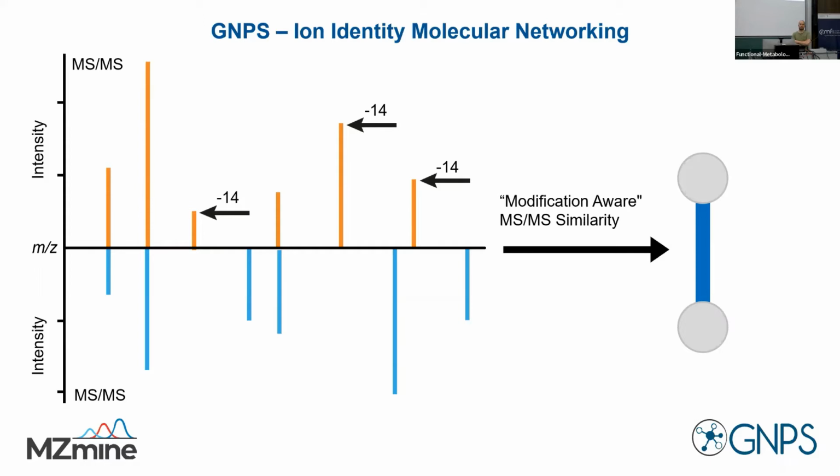Yeah. And this concept, even now, I still understand it better after years of working with it. Just last year I realized, oh yeah, you can also explain the modification, the 14 is also a neutral loss. Because if you just flip the spectra at the precursor and then you look, hey, wait, the signal is just shifted by 14.